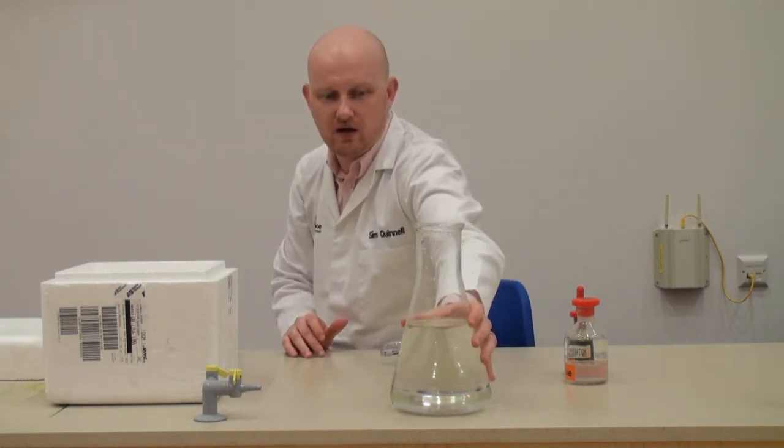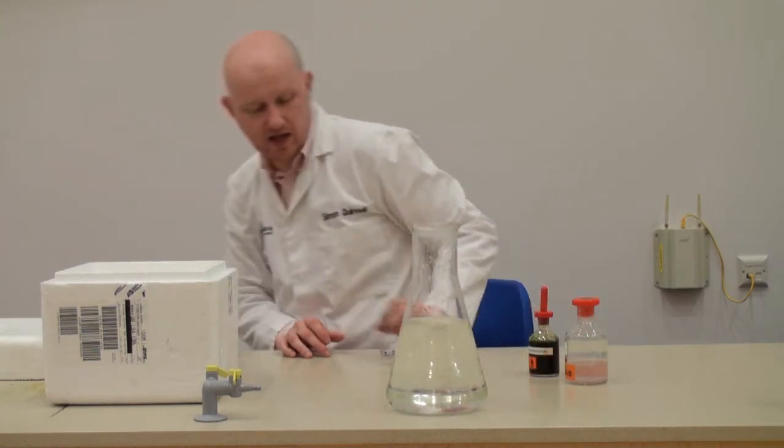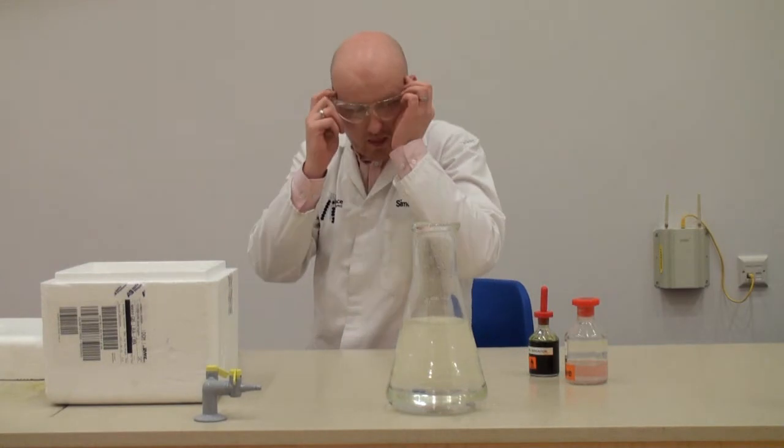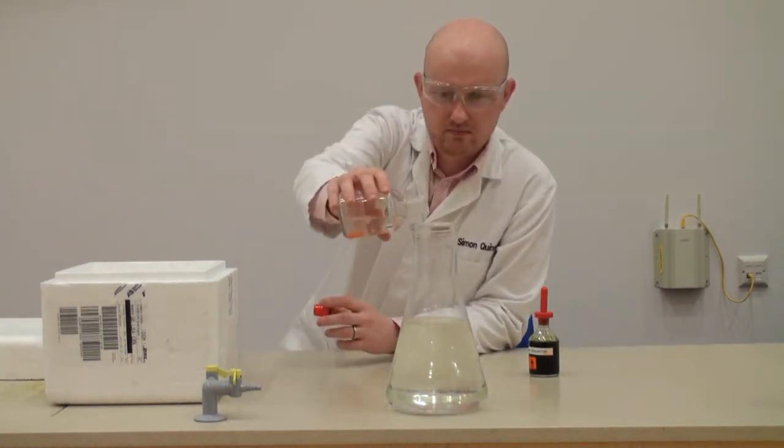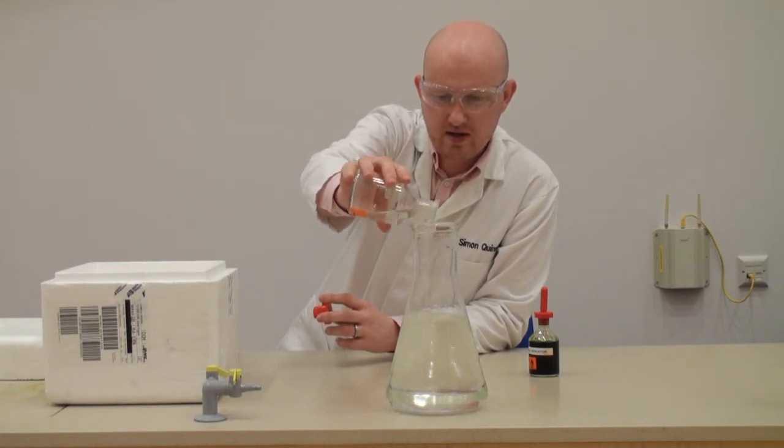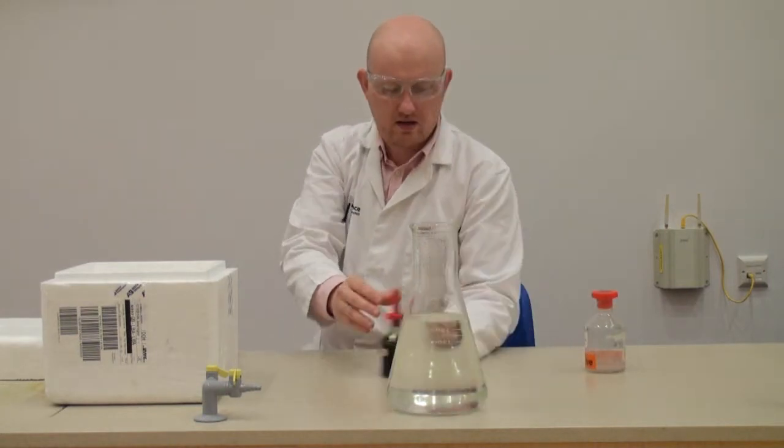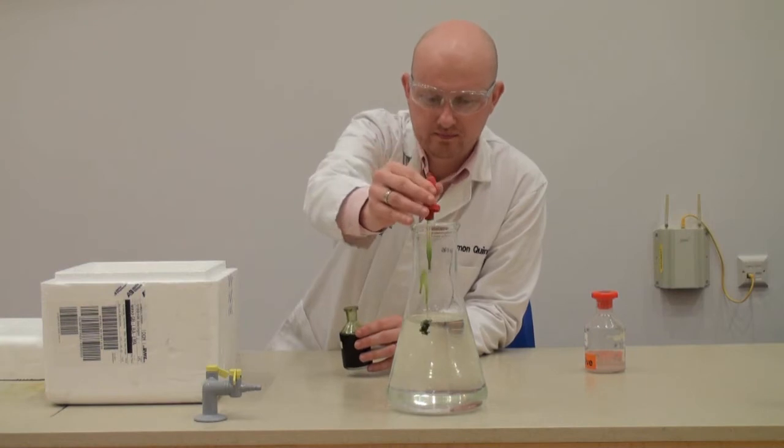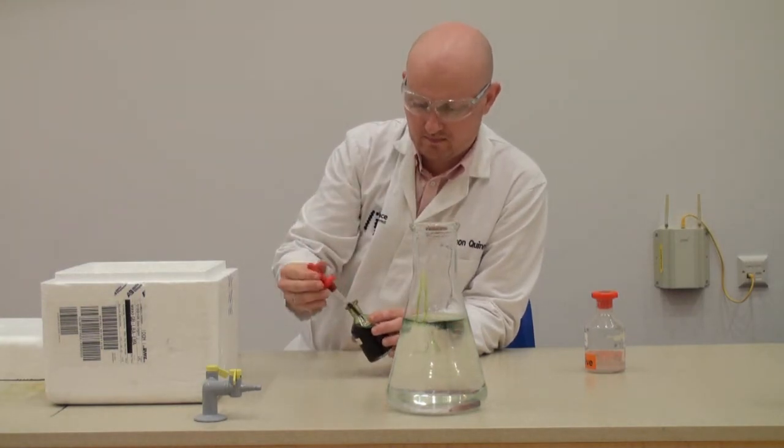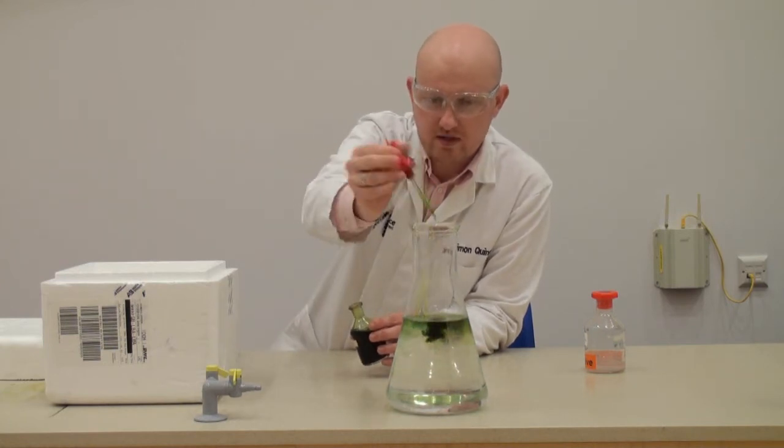Now over here, I have a flask with some water in it. To this flask, I'm going to add some sodium hydroxide. Now this is just to make it slightly alkaline. And then I'm going to add some universal indicator.